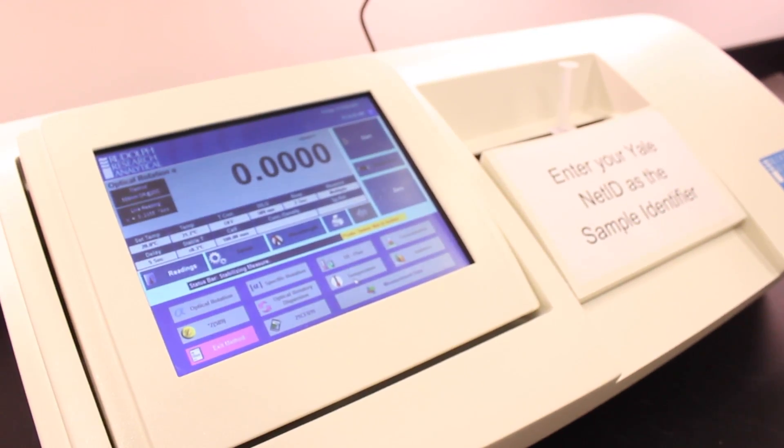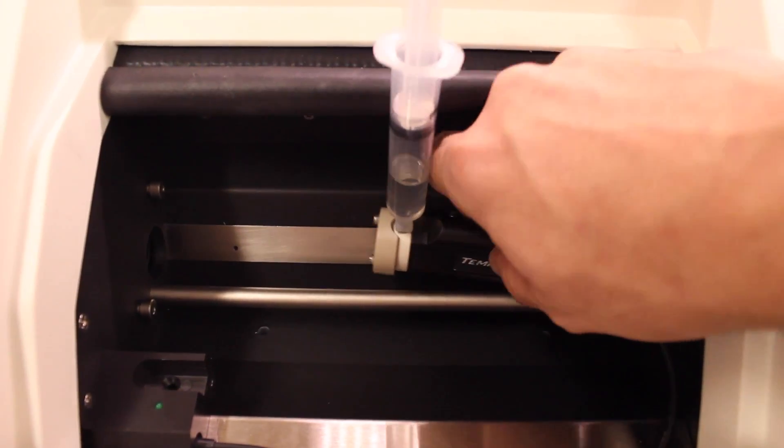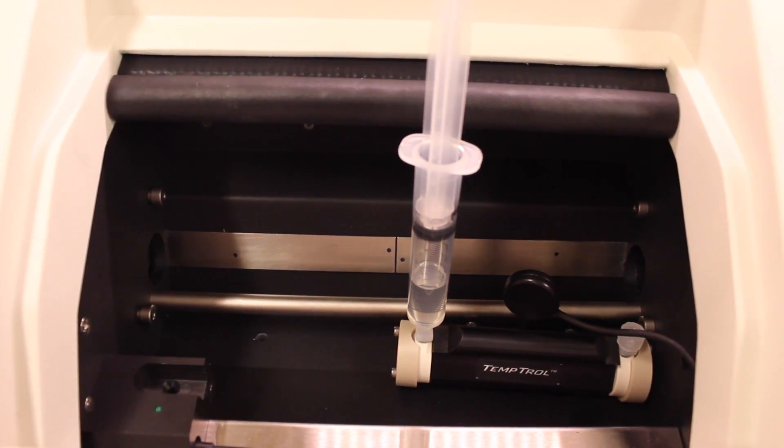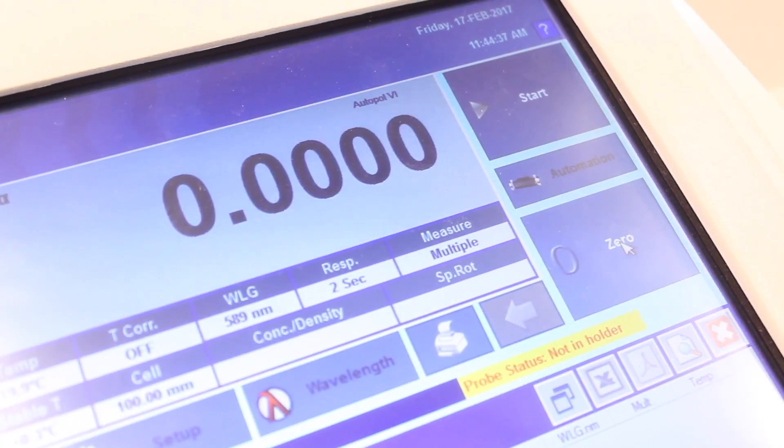After you've selected the method, it's a good idea to re-zero the instrument. For this step, move the polarimeter cell out of the optical path. It can be placed on the front of the sample rail, but the door should be closed during re-zeroing. Press the zero button to perform the re-zeroing.